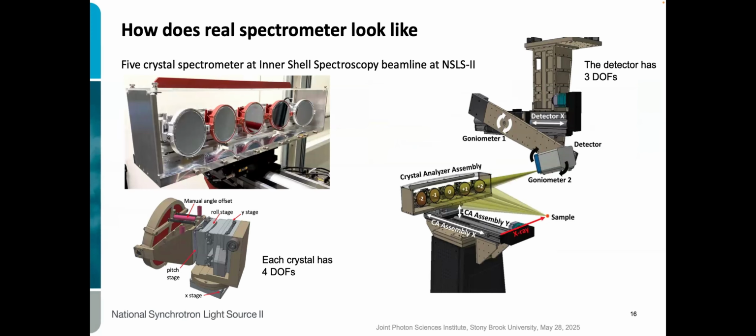The more crystals you have in your spectrometer, the higher your street cred within the community, right? And a good number for this is 5, right? So this is our five-crystal spectrometer. This is a detector arm. The sample sits here. We rotate here and move.